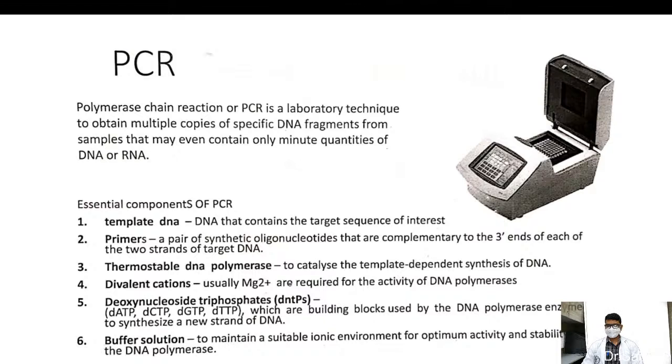As you know, it's a technique to obtain multiple copies of specific DNA fragments, that is target DNA, from the samples. Even a very meager amount of DNA is also sufficient to multiply, and it is mainly used for diagnostic purposes.